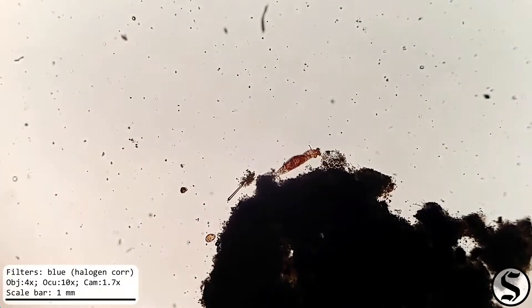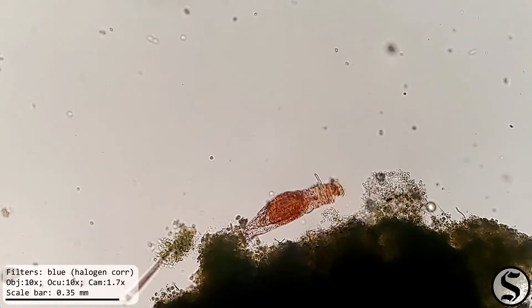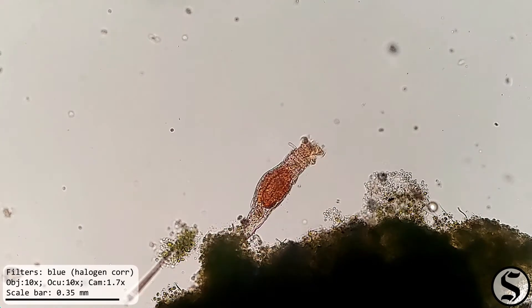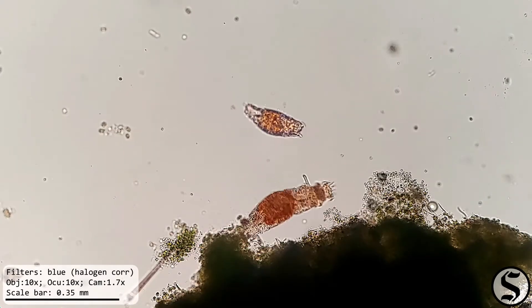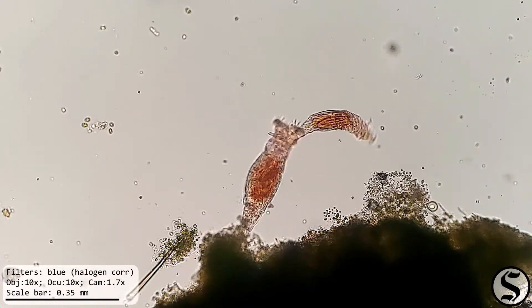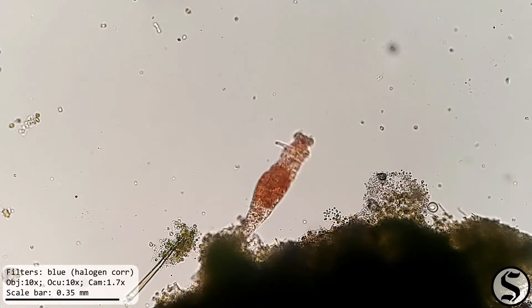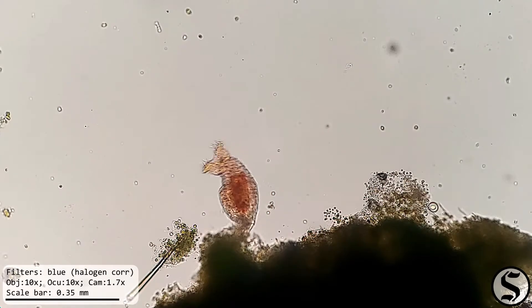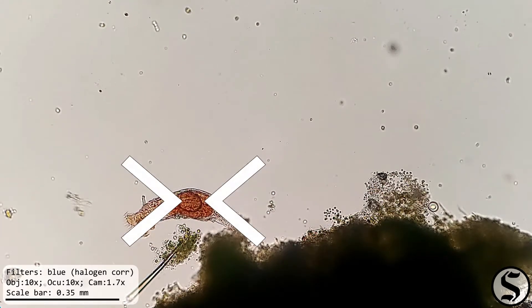I think maybe it's settled down now enough to check in on more closely. Oh, there's a little one. And it looks like this one has an egg.